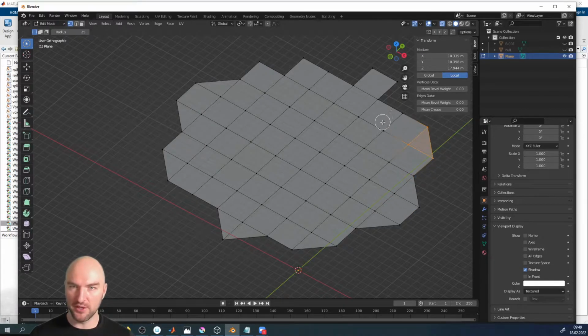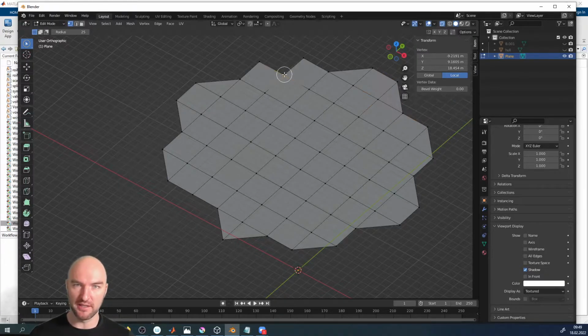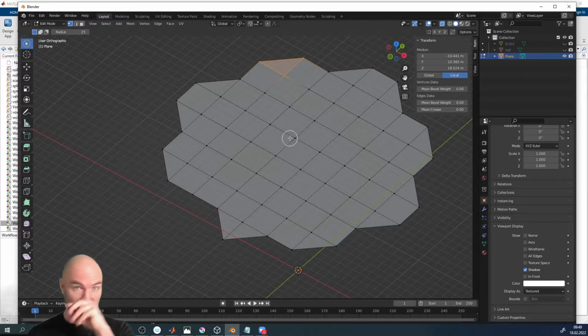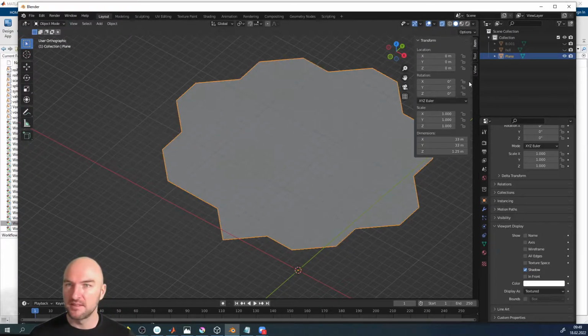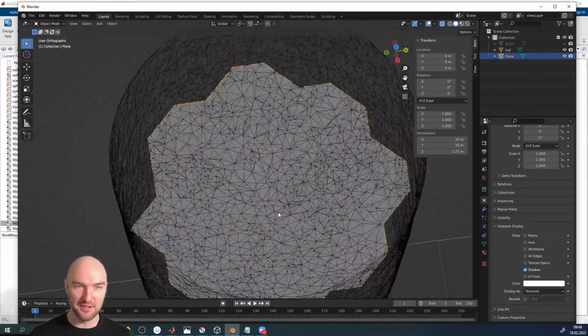That's, by the way, not something you absolutely have to do, but it will make your mesh topology nicer afterwards. If you do proximity, if you measure concentration towards the interface, proxigrams, it's not as big of a problem. If you want to do stuff laterally on it, you need to make sure that you've got a good mesh topology and a nice looking mesh with even distribution. Okay, so now we've got something that doesn't quite look like the intersection should look like, but it's kind of alright.